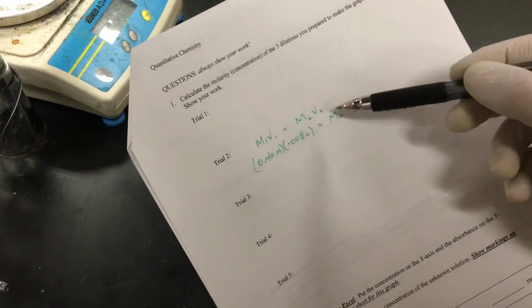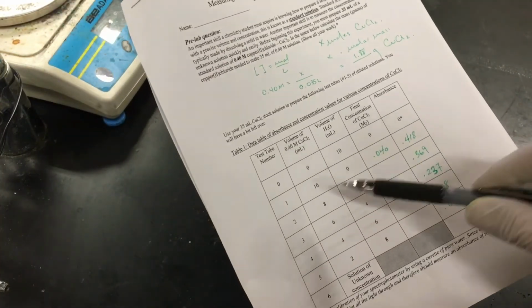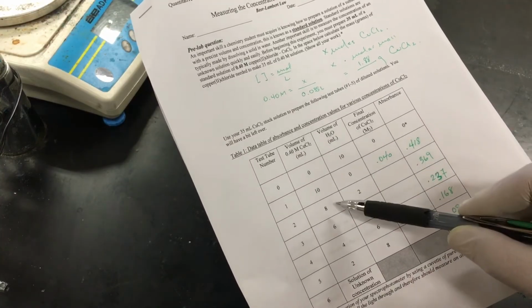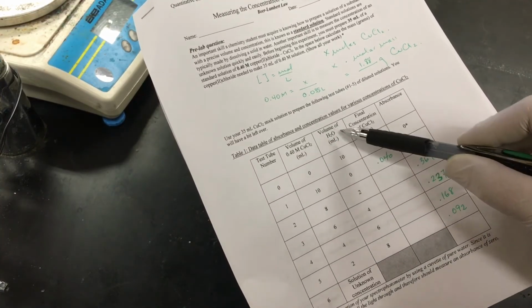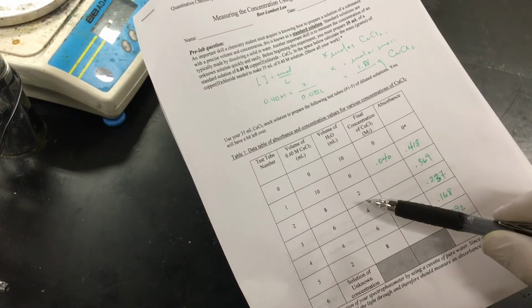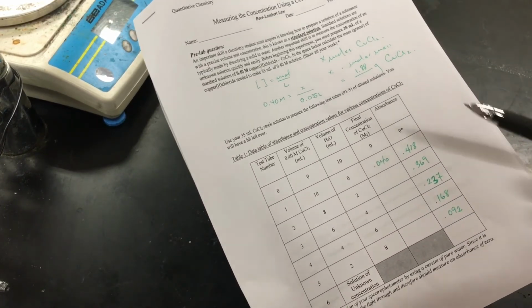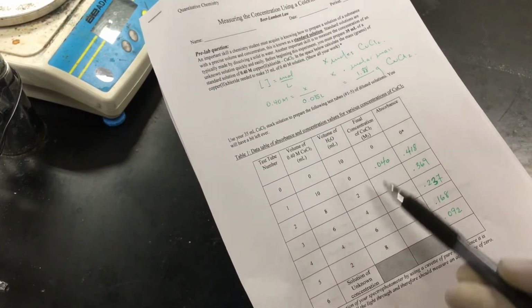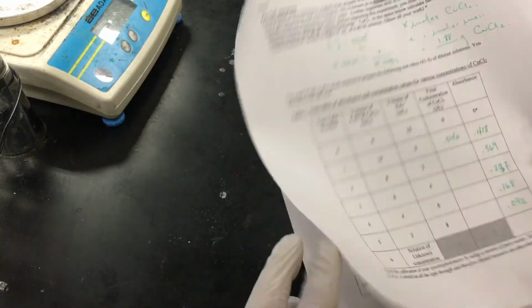Now, what was the volume after we added the water? So what we had in the test tube number 2 is 8 milliliters of the copper chloride. And then we added 2 milliliters of water. So what was the volume in the test tube after we added the water? Was the 8 plus the 2, which gives us a final volume of 10 milliliters.